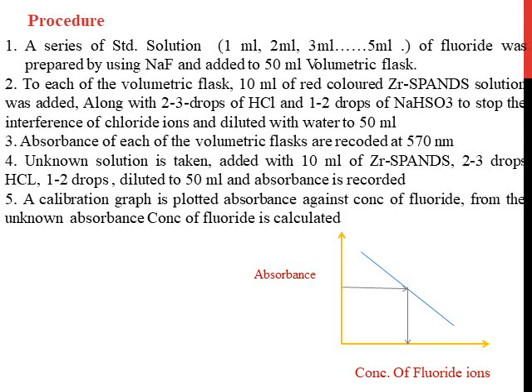Once it is done, it is diluted up to the mark in the volumetric flask with distilled water to make 50 ml, and shaken well. Now after making 5 different standard solutions, the absorbance of these standard solutions is recorded at 570 nanometer using a colorimetric instrument.